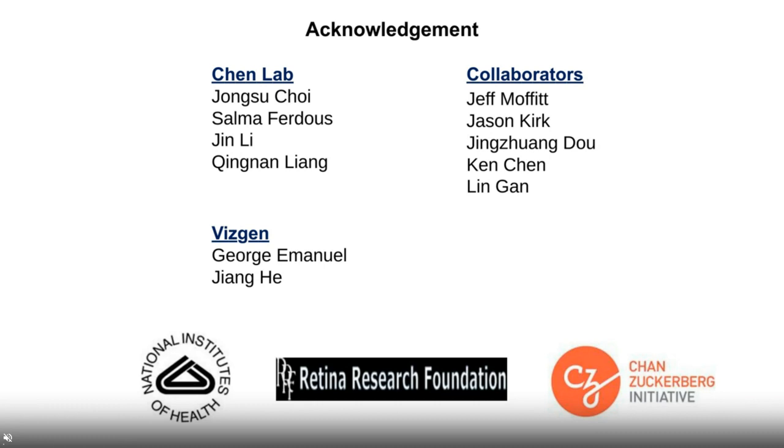For what type of projects would you recommend MERSCOPE, considering this is a targeted approach as of today? So I think MERFISH, of course, is limited. The major limitation of MERFISH right now is you need to pre-design a set of probes. I think it's quite reasonable to think that up to 500 or maybe 1,000 genes will be relatively easy to implement or optimize.